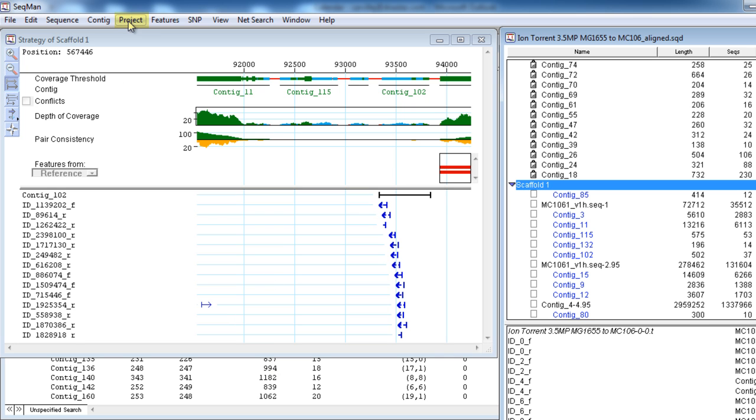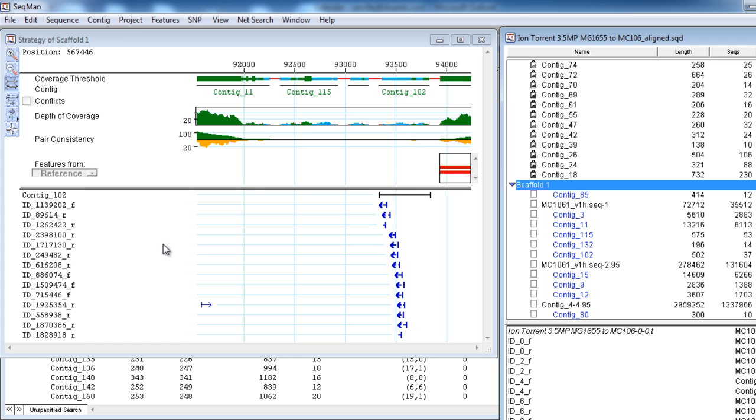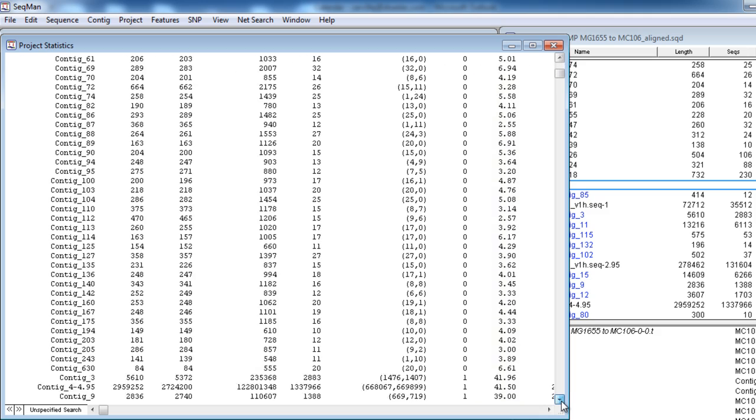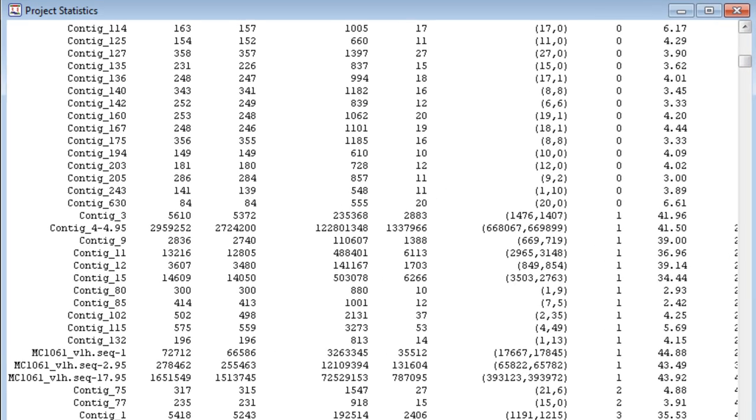In addition, you can also view the statistics report by selecting Project, Statistics. Within this report, you can look at the average coverage score. So if we scroll down to scaffold 1 and we again look at contig 85, we can see that the average coverage score here is only 2.42.